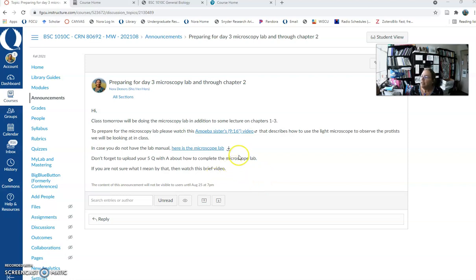Hey everybody, preparing you for tomorrow's lab. I'm about to send out this announcement to you. If you click here, it's a very short video, about 9 minutes, that shows you the light microscope and the different parts of it and how to use it. The Amoeba Sisters do a great job.